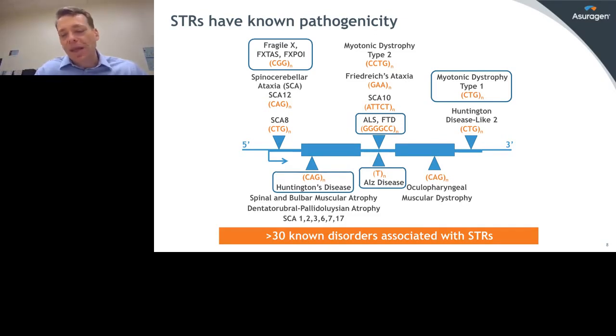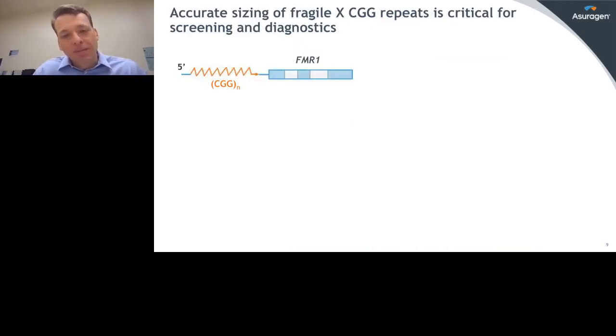I'd like to put a spotlight on a handful of these today, 5 of these, and talk specifically about how we've developed PCR technology to be able to consistently read through these repeats, whether they're AT-rich or GC-rich, and how those products can be interpreted on the right platform, like a genetic analyzer, capillary electrophoresis, to generate definitive results for clinical research. And I'll talk about 4 of these pathogenic disorders, 1 emerging risk marker in Alzheimer's disease. These represent 3 products that we've developed that are on market from Asuragen and 2 that are in development. So let's start with Fragile X.